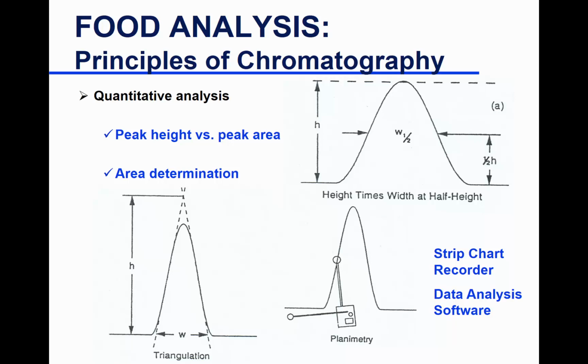In quantitative analysis, you have to determine a quantitative measure. So you need to obtain a measure that you can use to quantitate. Oftentimes what you look at is when you have a chromatogram, you have peaks, right? So this is the output you have, chromatographic peaks. So how do you use them to quantitate? You look at the peak and there is a peak height, and you can actually get a peak area. In quantitative analysis with HPLC or even GC, we often go with area.